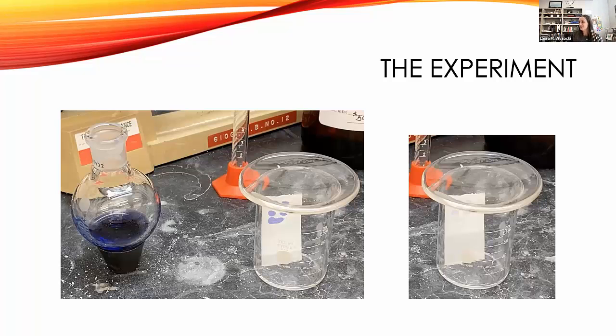So this too to them is a little bit perplexing, and it starts a conversation about what might be different in a saturated solvent environment versus just the silica plate itself. What is silica gel? What kinds of interactions might encourage different dye forms? And these are the conversations that I love as a professor because it gets students to really dive deeper.